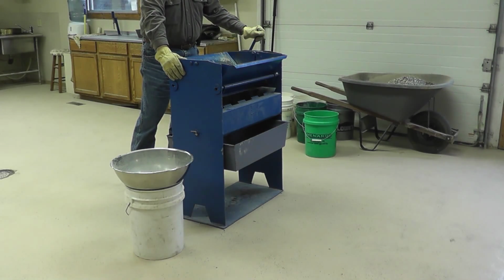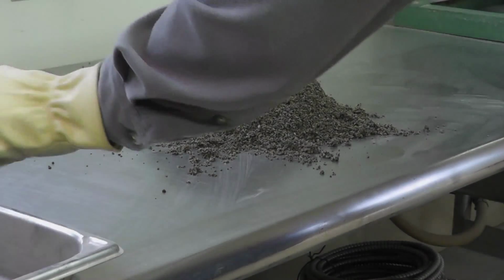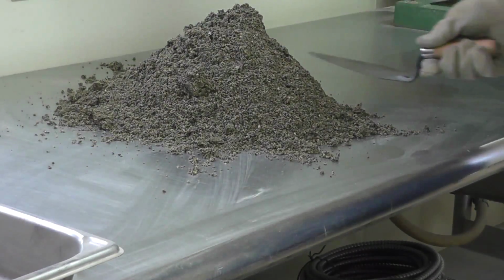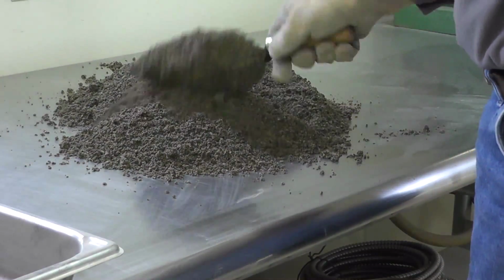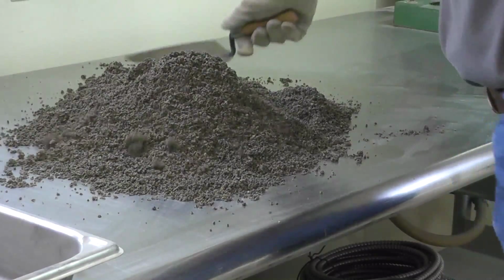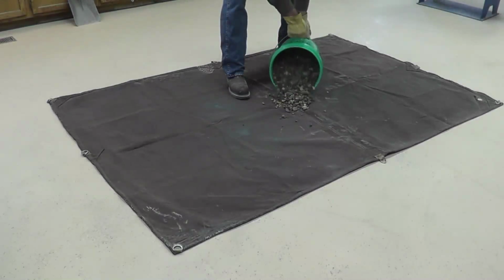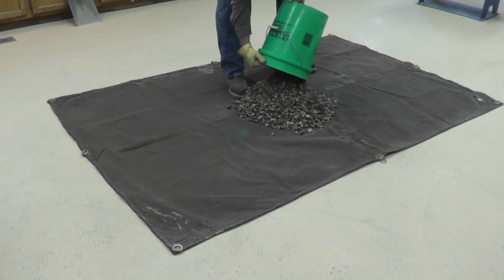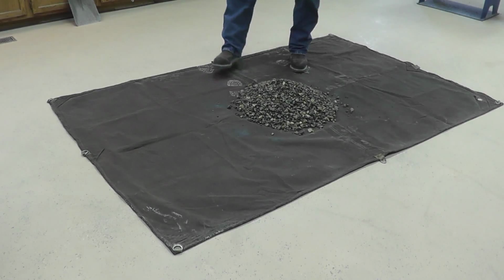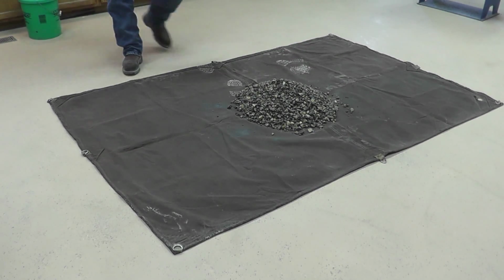Once material has been sampled in the field, the material then has to be reduced to the appropriate sample size for testing. Depending on the size and type of material to be tested, the technician has several options for reducing the field sample. This presentation will explain which sample reduction methods are appropriate for all sizes and types of samples. Additionally, each sample reduction method will be demonstrated and explained individually.